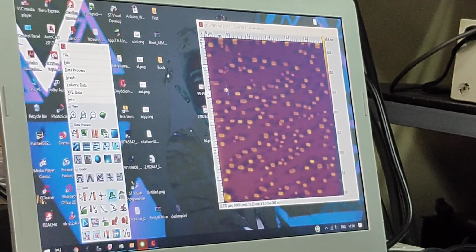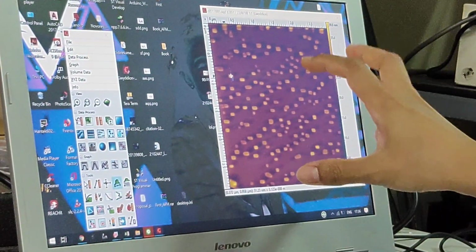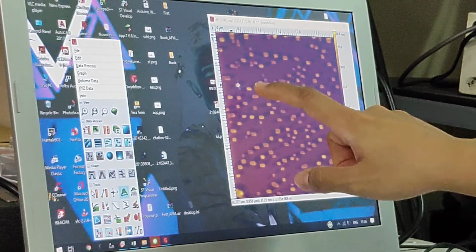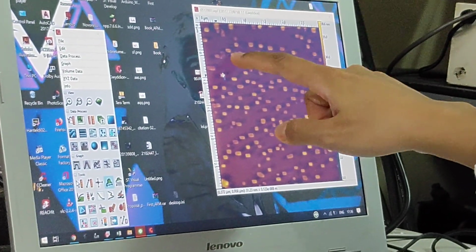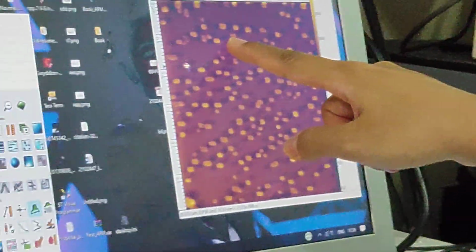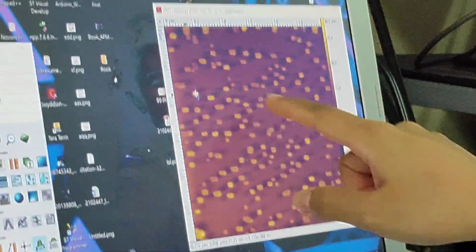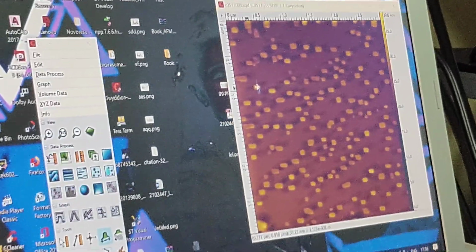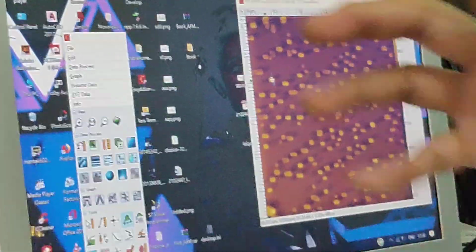But you need to remember which quantum dot you already finished. I know that after you go like this, you get confused. I already finished this. How about this? You were confused. Do you have a technique? The easier way is to print out and mark. Print out and mark.